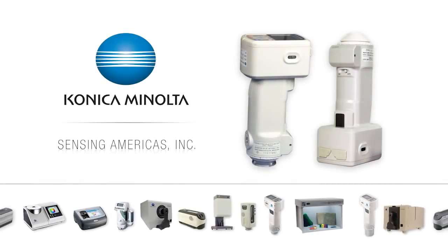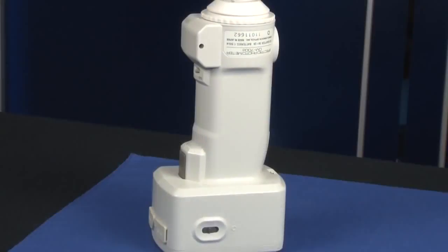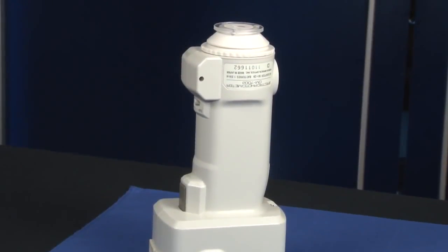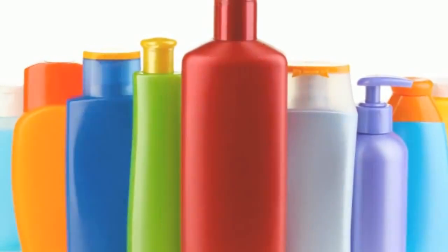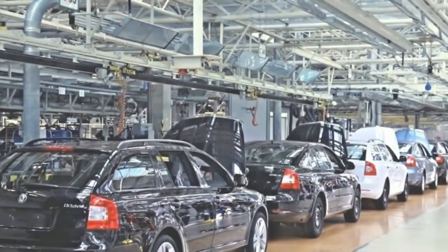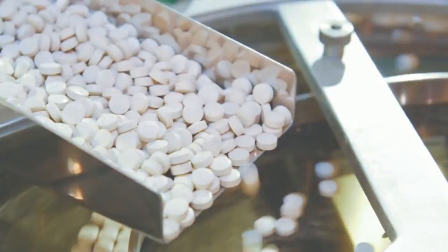Our best-selling CM700D spectrophotometer is globally accepted as the standard for a wide variety of applications in the plastics, automotive, pharmaceutical, and paint industries.